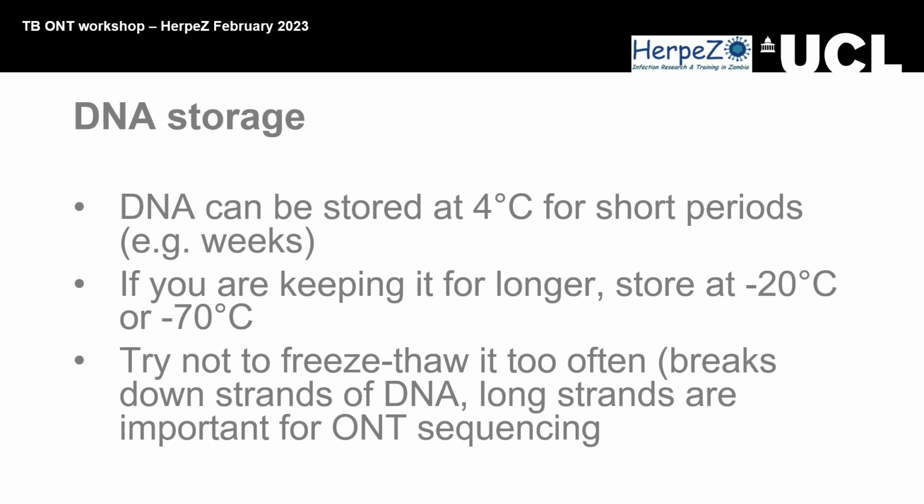DNA quality control part this afternoon, if you put rubbish DNA in and it's all smeared and it's not a nice neat band and it's not really high quality, then you're not going to sequence very well at all. It's just going to be rubbish basically. And also one sample that's really poor can affect the sequencing sometimes of the other samples. So it's worth your effort to repeat the extraction rather than worth your costs to repeat the sequencing, because obviously it's not cheap to do that.